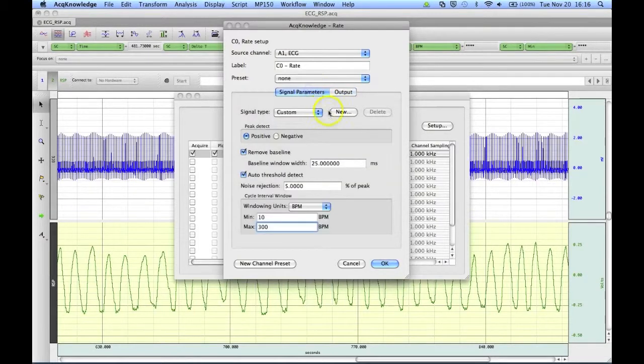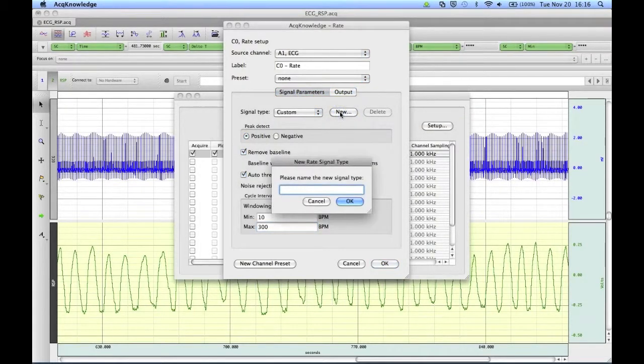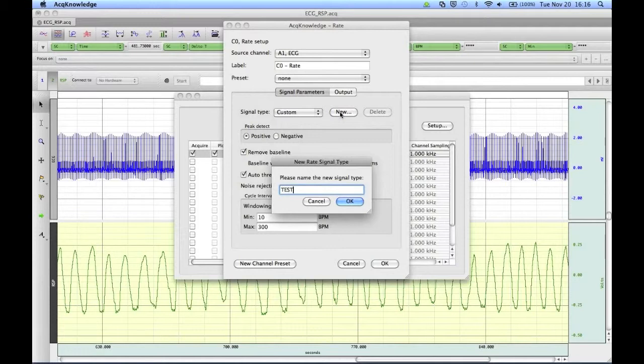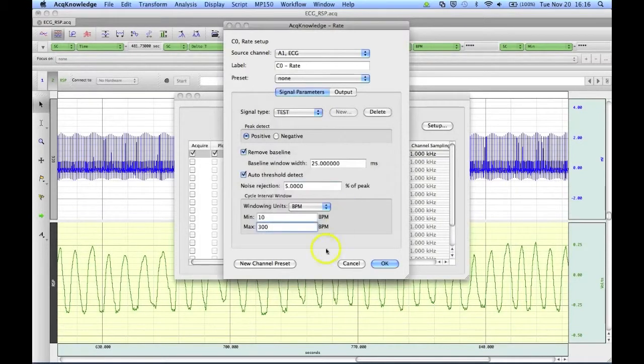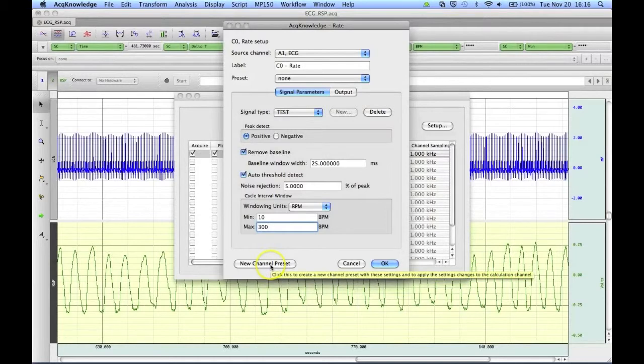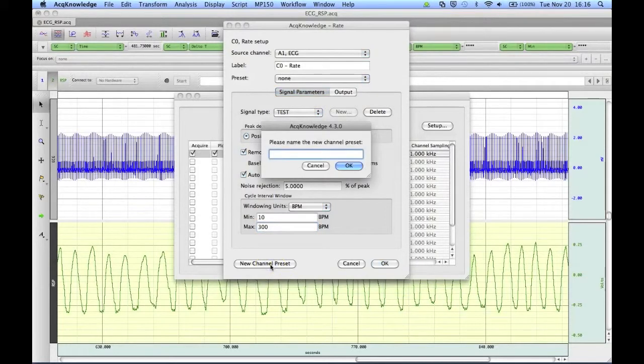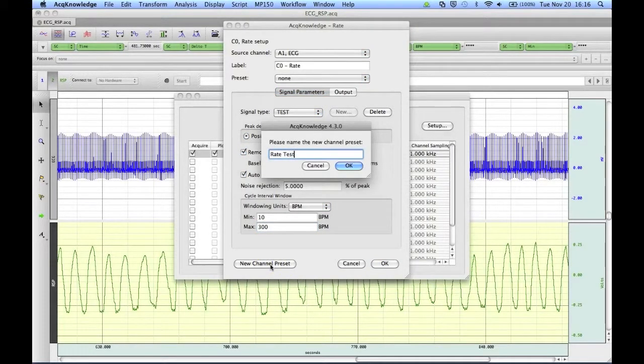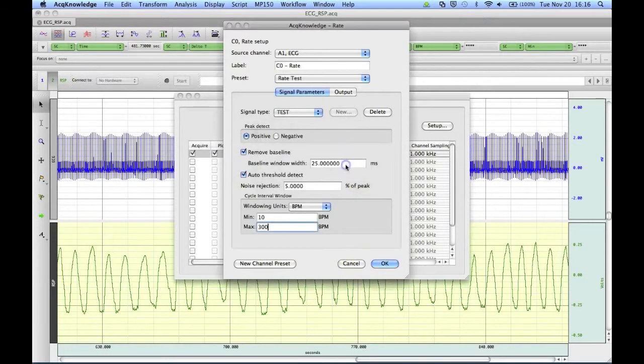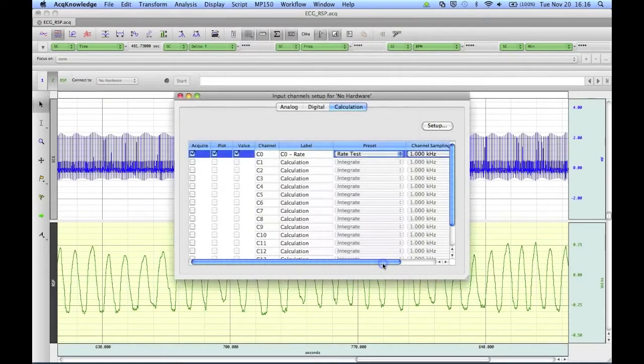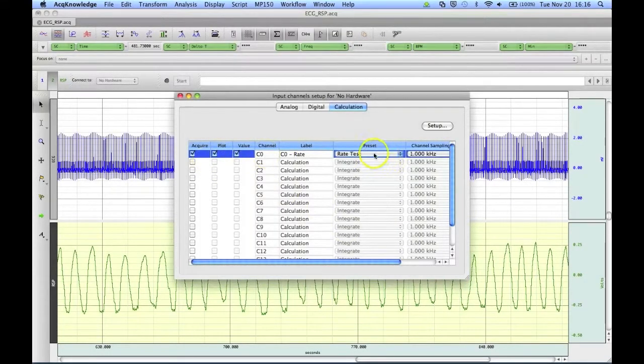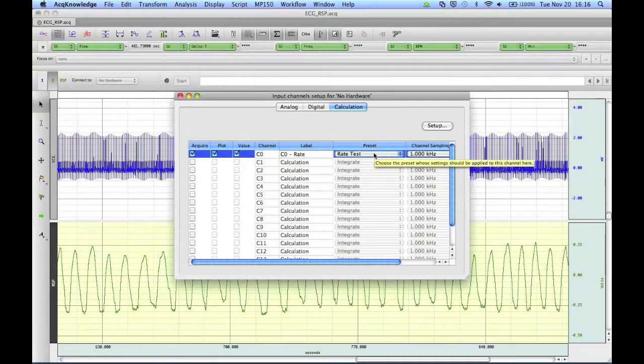We can then go back, make this a new signal type, I'll call it Test. We can then save this whole thing as a channel preset by clicking New Channel Preset. Now I will call this Rate Test, and click OK. And we can then click OK. And now our calculation channel is set up to our custom preset settings.